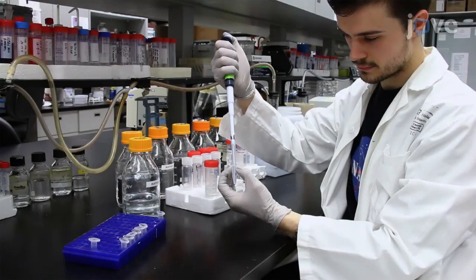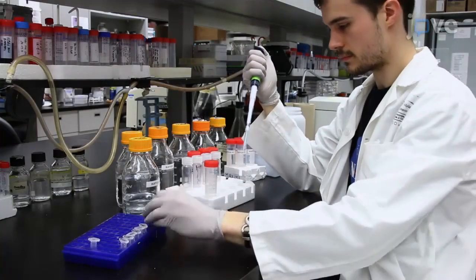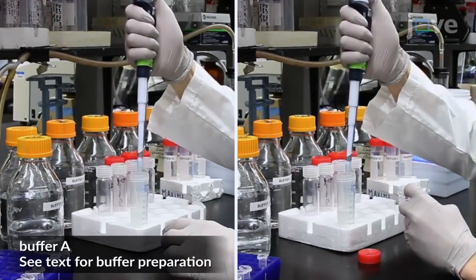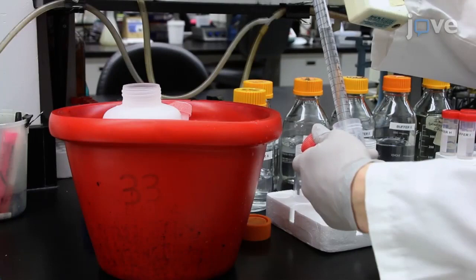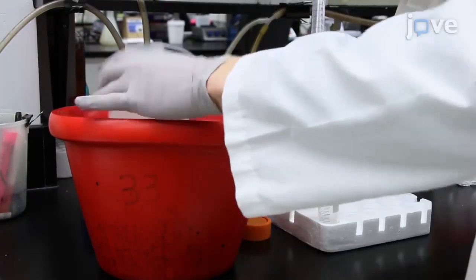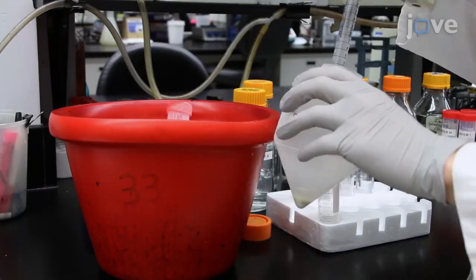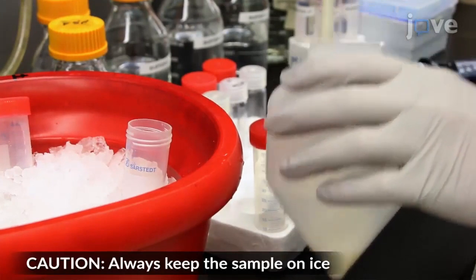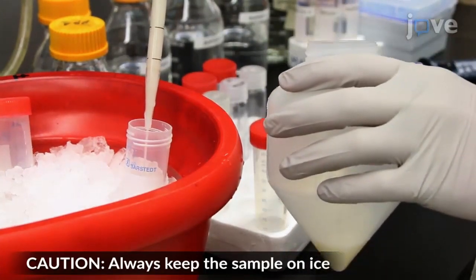To begin bacteriolysis, add PMSF, an antiprotease cocktail, into the ice-cold lysis buffer A. Add 25 milliliters of the lysis buffer A into the bottle containing bacteria pellet and resuspend the pellet. Transfer the lysate containing bacteria in a tube for sonication.